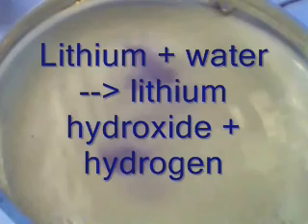I'm going to light it with the lighter, because it's just simpler. There you go — did you see that? You can also see that the alkali metal has made the solution alkaline, of course. Let's try this one more time. I can feel it building now, definitely. There we go. So now we know that lithium gives you a reaction. It's not particularly strong, that reaction, but it gives you a sort of reaction. And you can pop the hydrogen from that. So lithium metal plus water gives you lithium hydroxide and hydrogen gas.